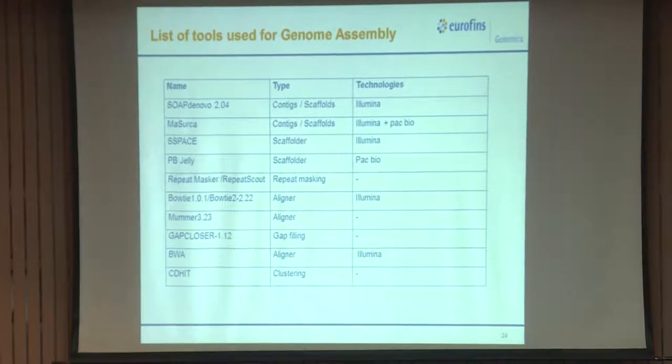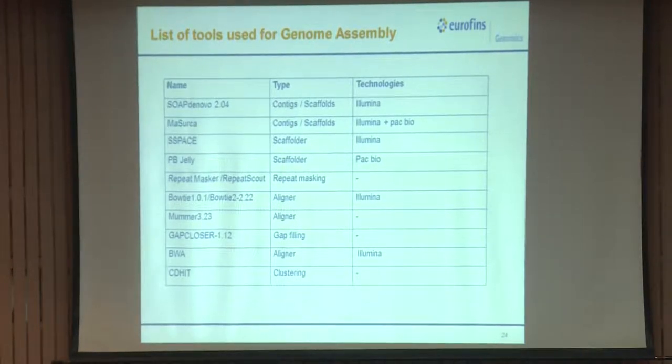And if the maximum number of reads are mapping to the genome, then we say that the genome has been assembled in a proper manner. For example, if I'm only able to map 10% of the reads back and the rest of the reads are not mapping, that means the overlapping or whatever we have done is wrong. My genome is not getting mapped. The reads which we have generated should be at least 90 to 95% mapping back to the genome, right?